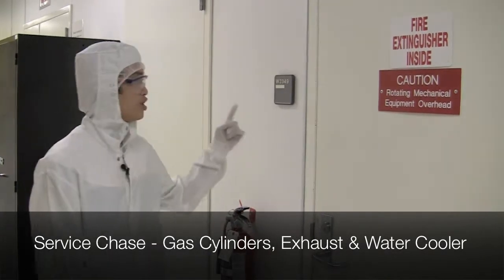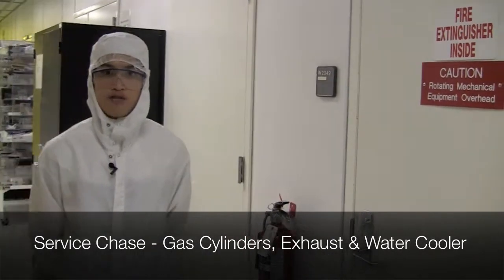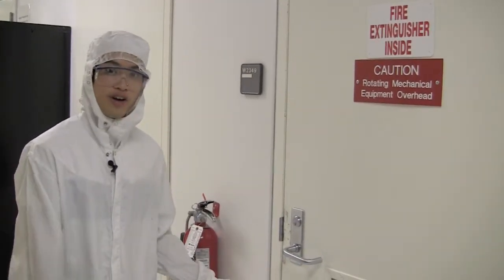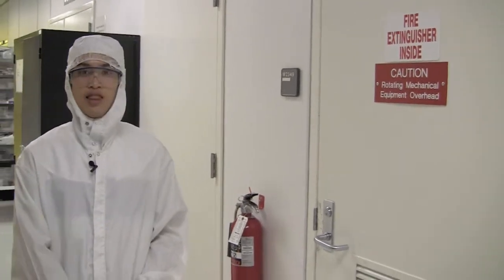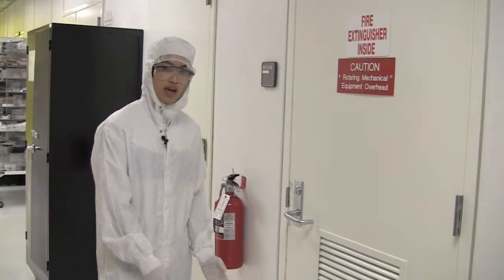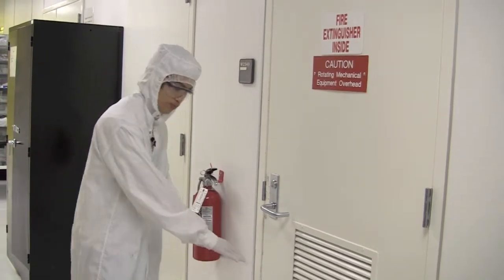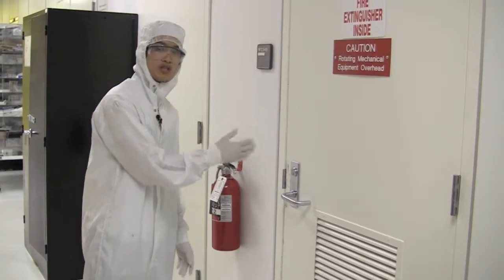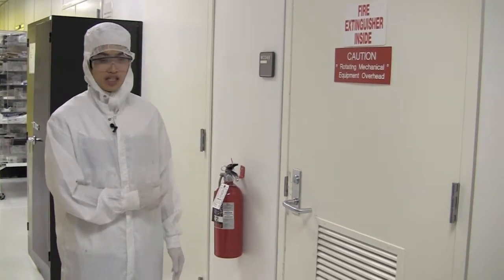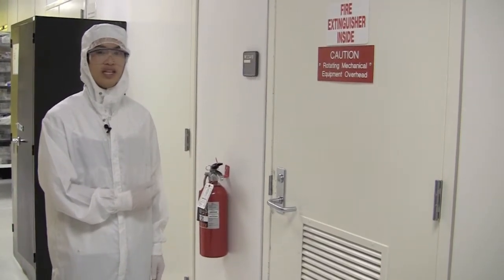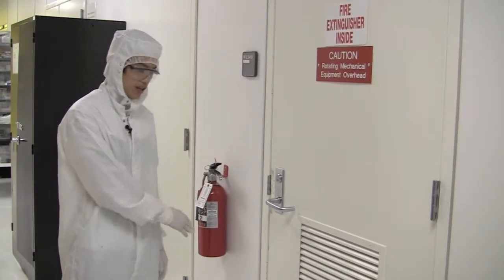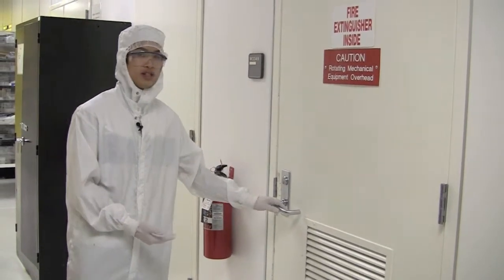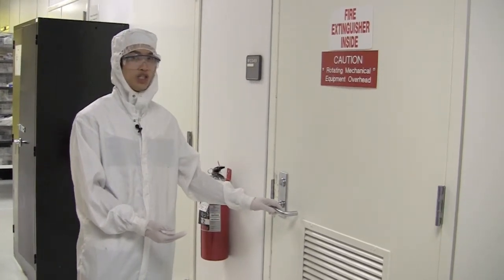We're standing outside of 2349, which is the service chase for the Easy Tube 3000. We need to verify that the gas cylinders are turned on and the water chiller is on. But before we enter, we need to make sure there's no spills outside the service chase door and no pungent smells coming from it. If you ever see one of those situations, contact staff immediately. Today, there's no spills and no smells, so I'm going to enter the service chase now.